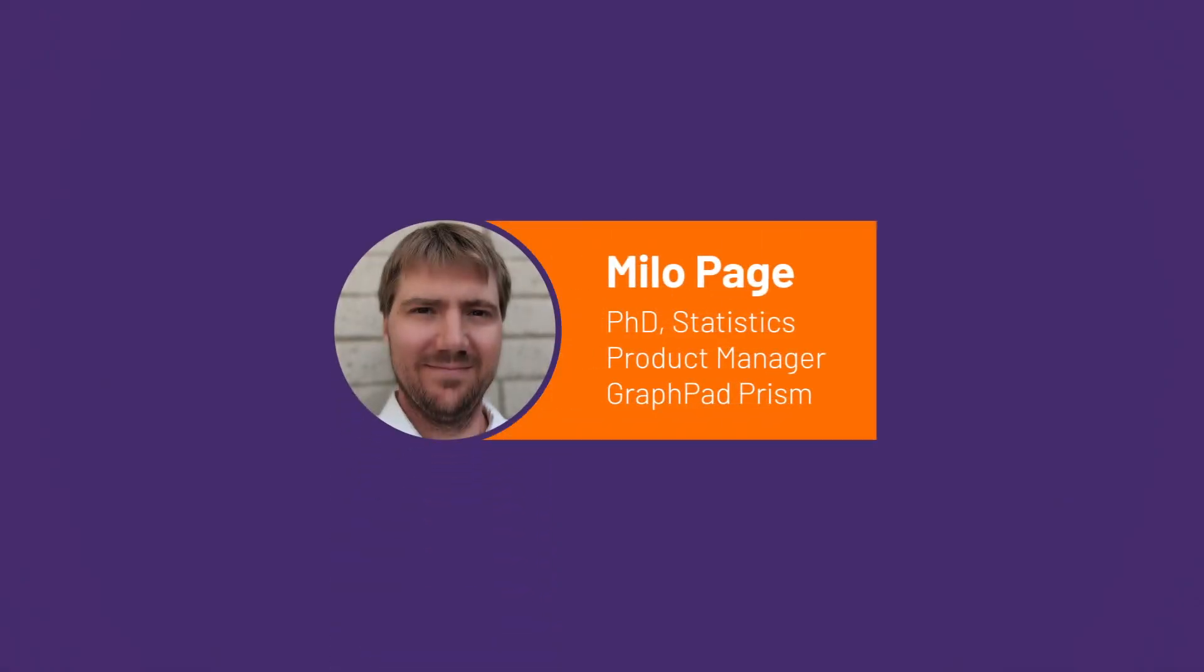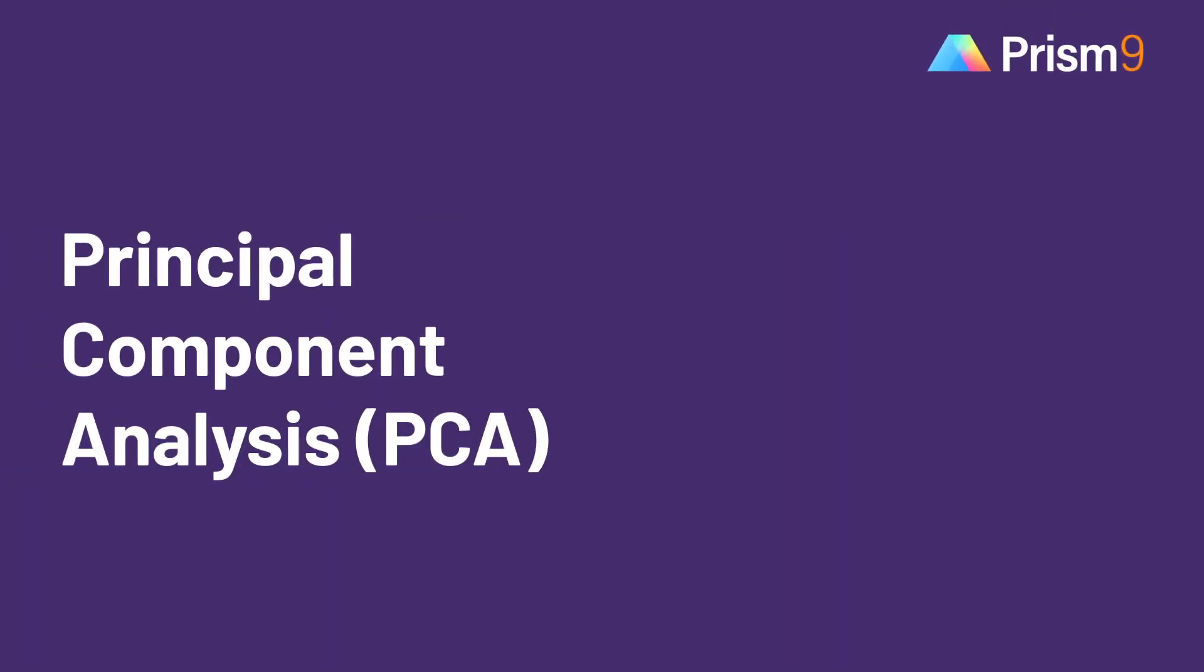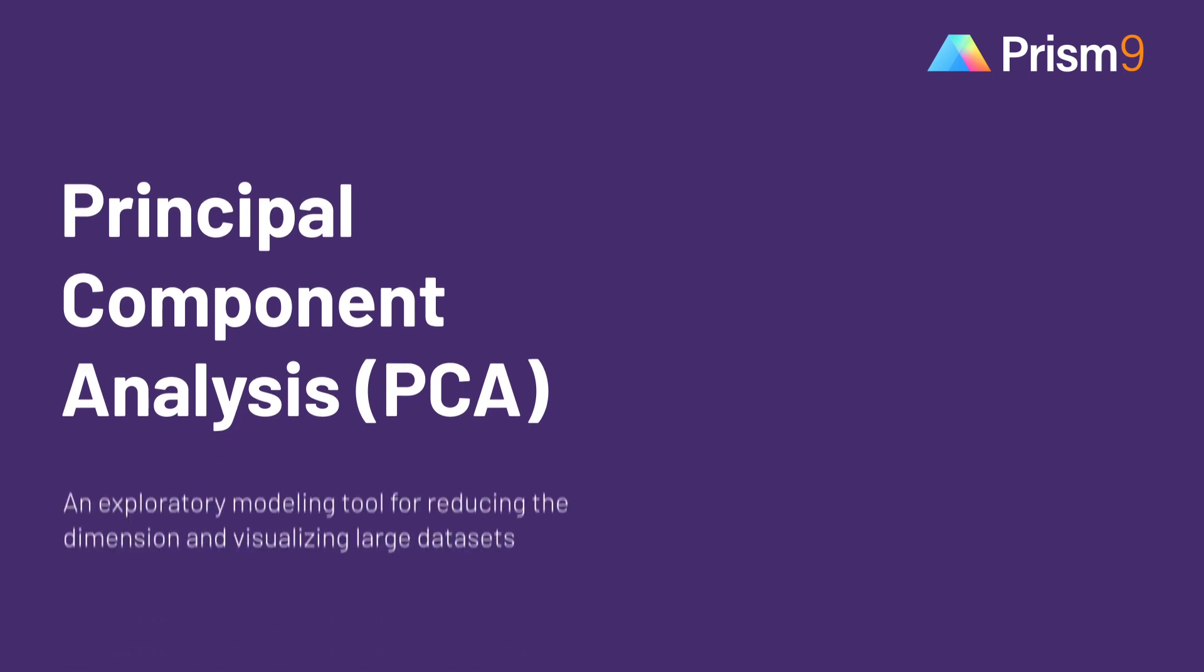This is Milo Page from GraphPad. In this video, I will be introducing Principal Components Analysis, or PCA, which is new in PRISM 9.